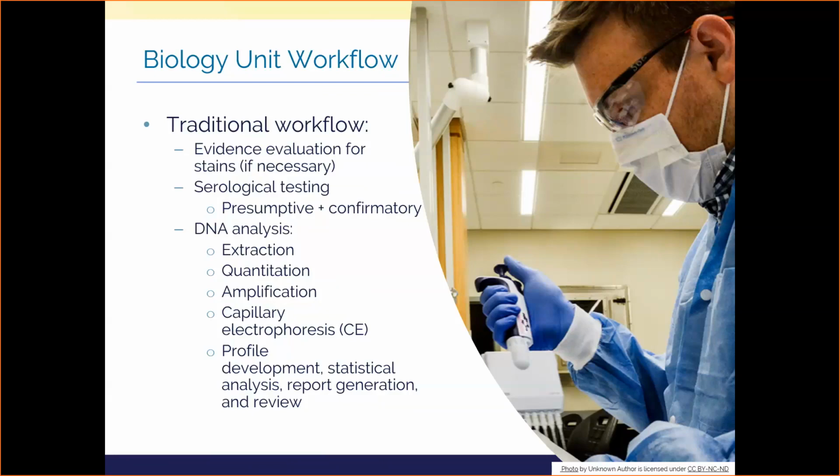In serology, with an example, a small stain or a potentially dilute stain, one might simply not serologically examine. Now, why is that? Well, we could actually run the risk of using too much sample to determine if it's a body fluid, and could thus prevent downstream DNA analysis if we consume the entire sample or take too much, leaving too little DNA behind for subsequent DNA analysis. Thus, some labs have caveats to their workflow, where certain types of stains, such as those that are too dilute or those that are very small, will be taken straight to DNA. After all, it's sometimes more important to know who a stain originated from versus knowing what type of body fluid is present and then never getting a DNA profile.